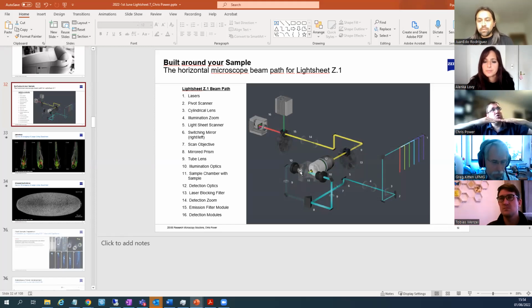Each of these you adjust. So you have an adjustment, it's a slider in the software, and you adjust one side and you adjust the other side. And the way you usually do that is you basically make them the sharpest. So if they're out of focus, they're blurry. So you would adjust, and you go blurry, sharp, blurry, and you would do that for each of the 2 sides so that you know that they're in the same plane.